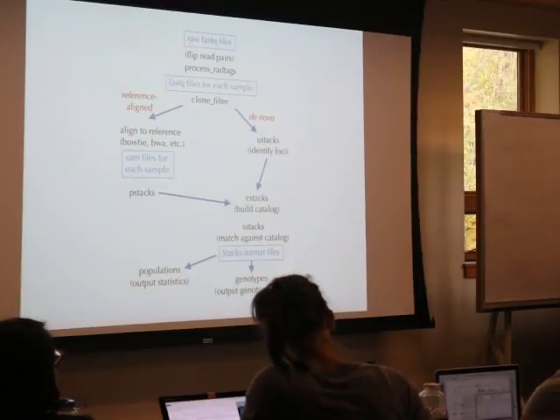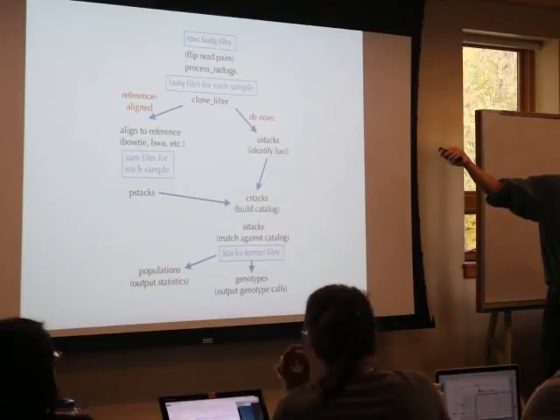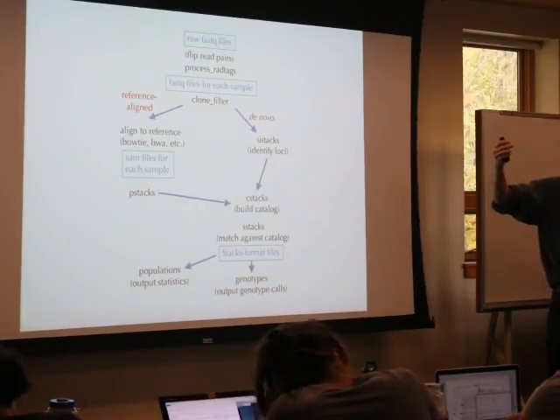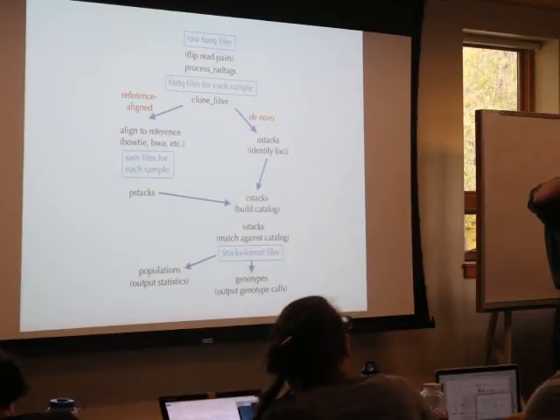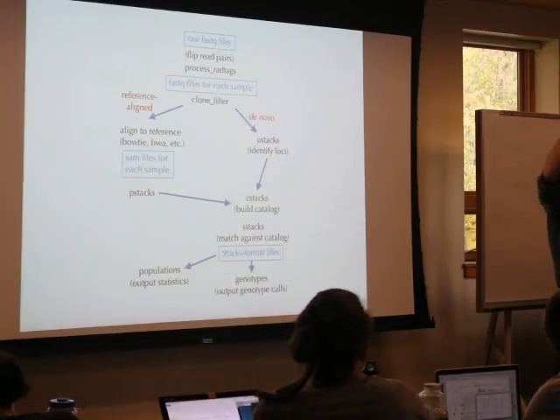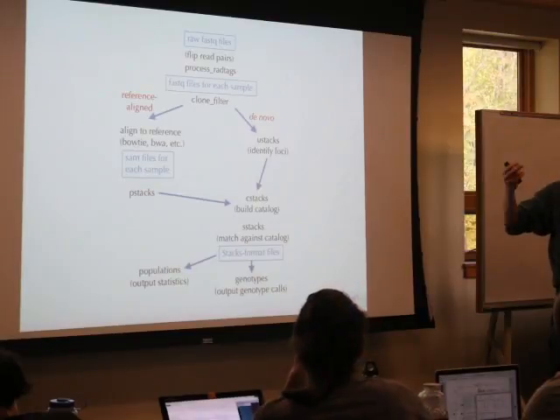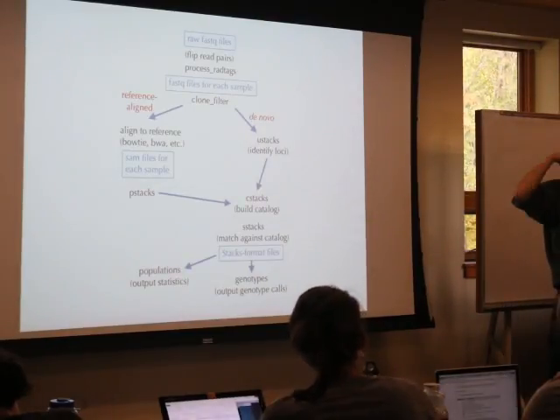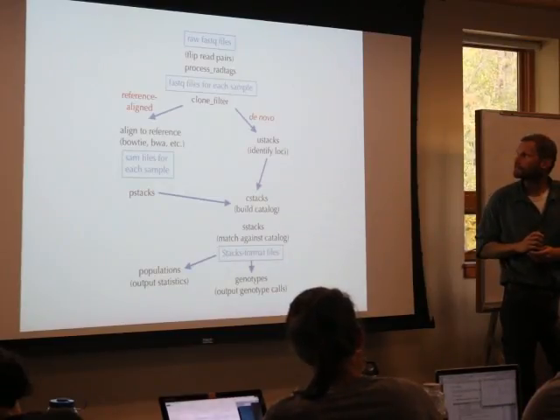The raw FASTQ files you get off the sequencer will usually have an R1 file and an R2 file, and they're lined up in pairs. But the cut site might be in either R1 or R2. The output from this split code puts the cut site ends all in the first file, and the pairs in the other.